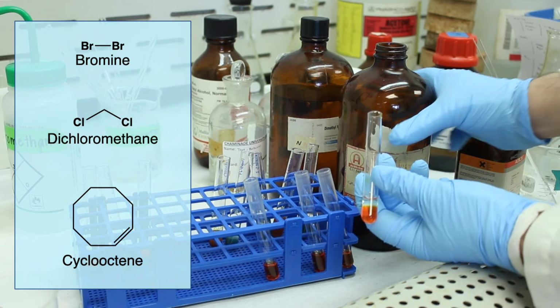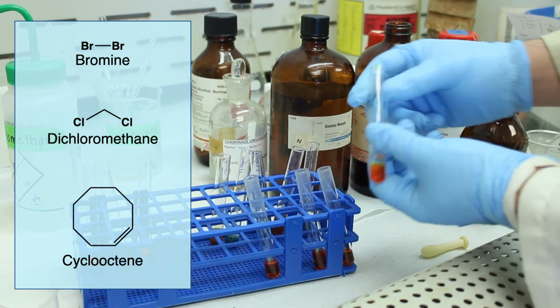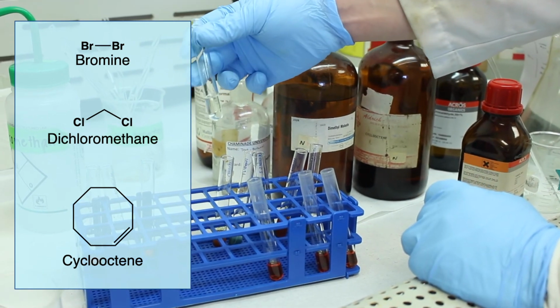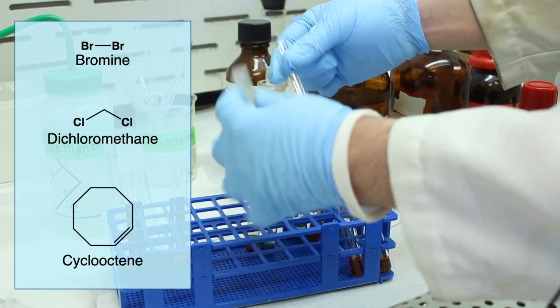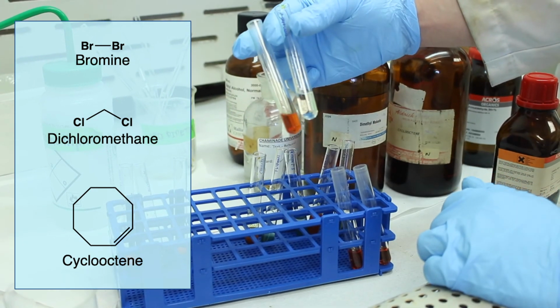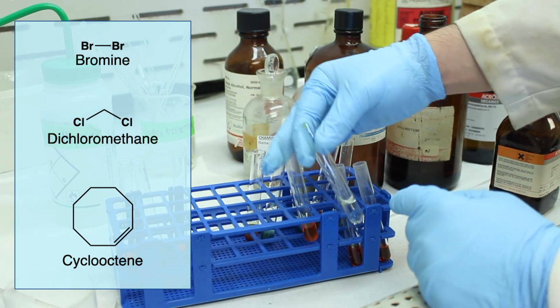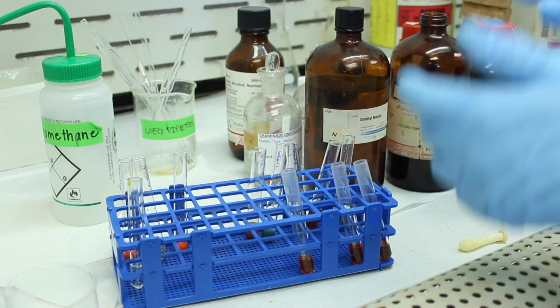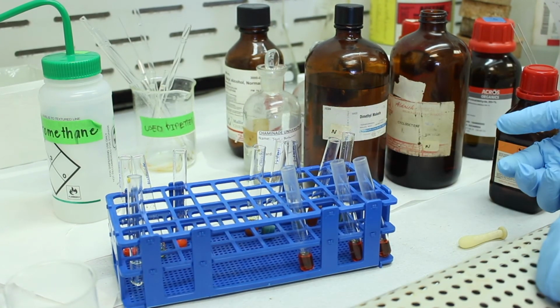This looks kind of old for cyclooctene. It's kind of viscous. Anyway, so there we go. A little bit of agitation, and you can see the red color has disappeared. Nice. So positive test result for cyclooctene. Place that one in the back. We're going to get set for the next one because it's going to require some heating.